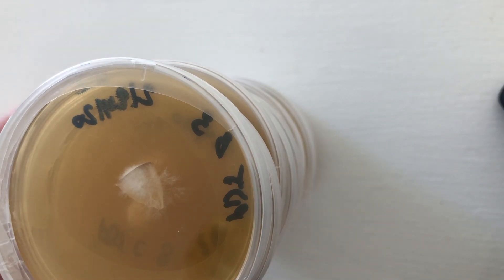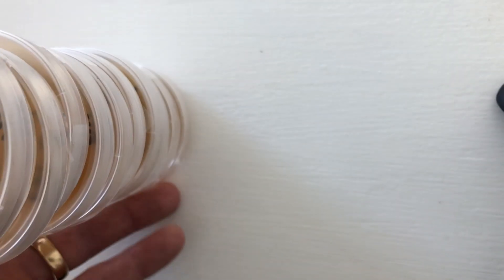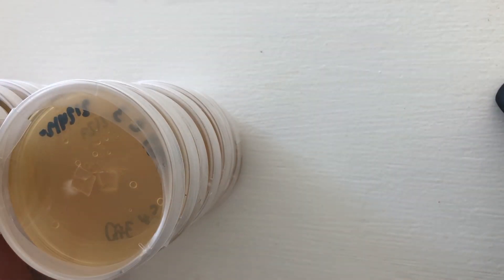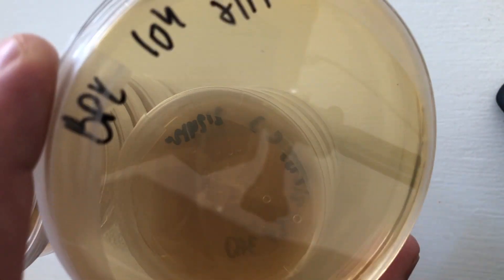From chestnuts I got about eight isolates out of probably 12 plates. The lion's mane — I haven't found any clean ones yet. The black pearl has one isolate, and the piapino we're still waiting on.